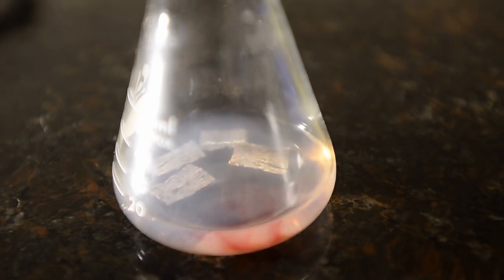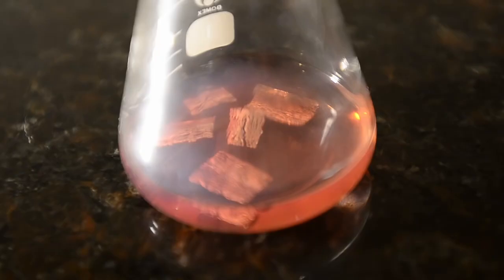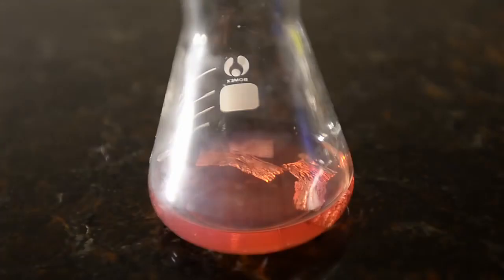We added a small amount of a methyl iodide solution in dry dichloromethane using the same proportions as before. Once again after a few minutes we saw no reaction. So we added the remainder of the solution and then waited.